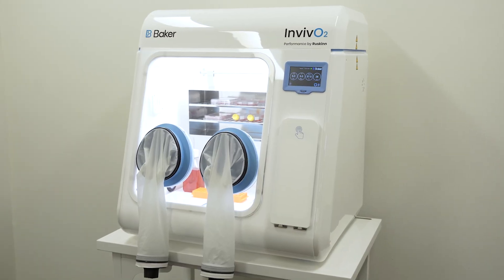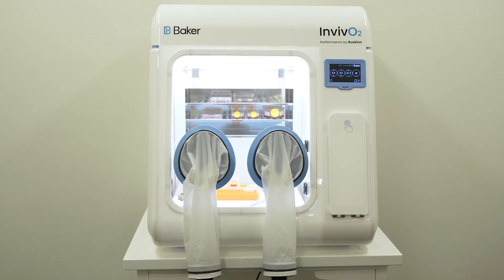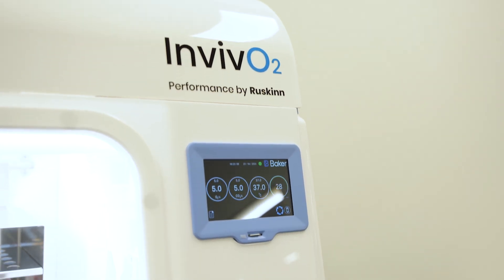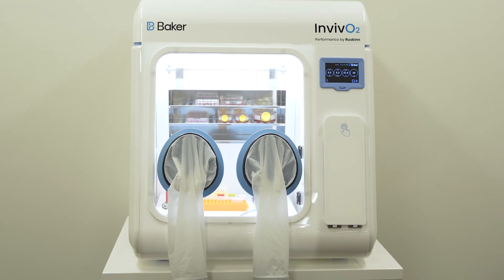Baker is thrilled to announce the newest addition to our line of innovative closed hypoxic culture systems: the In Vivo 300, a compact workstation that provides ample workspace under optimal culture conditions with little impact on your benchtop space.